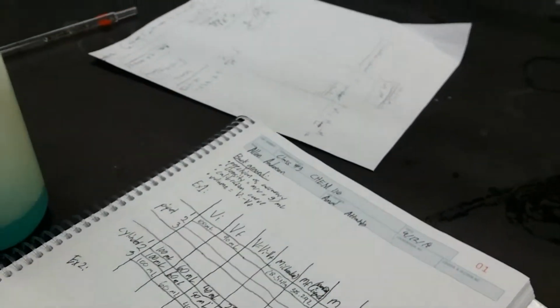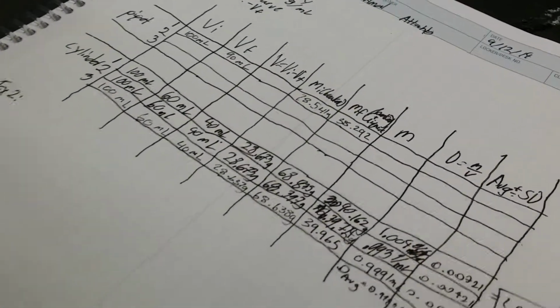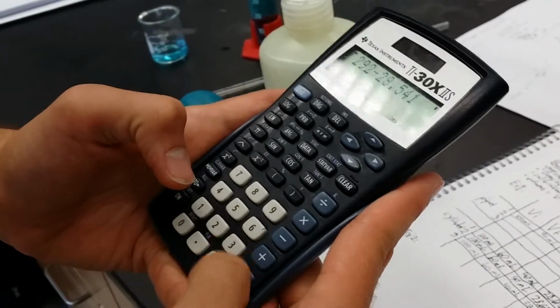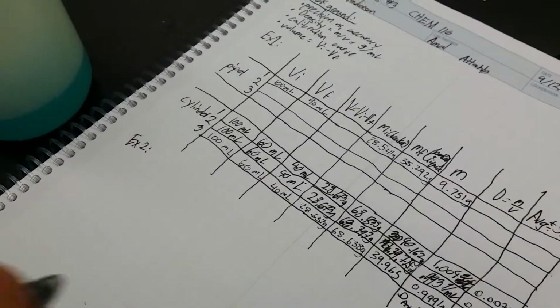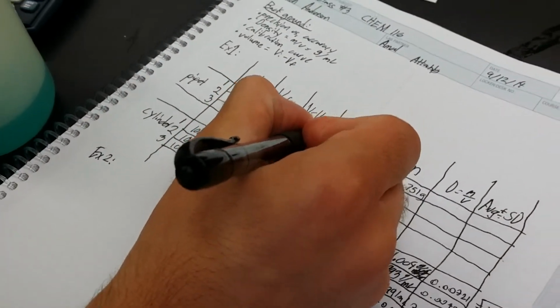The mass final is 38.292. And then we gotta find the mass by subtracting the mass initial from the mass final, which is 38.292 minus 28.541, and it's gonna be 9.751. Okay, so we have to write our name on this and then say what category we think that we deserve. Alright, and the V is going to be 100 minus 90, which is 10 milliliters.